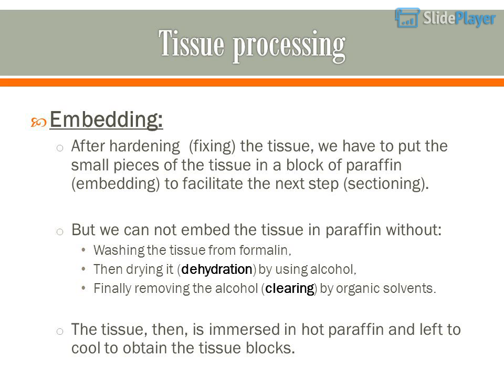But we cannot embed the tissue in paraffin without washing the tissue from formalin. Then drying it, dehydration, by using alcohol. Finally removing the alcohol, clearing, by organic solvents. The tissue, then, is immersed in hot paraffin and left to cool to obtain the tissue blocks.